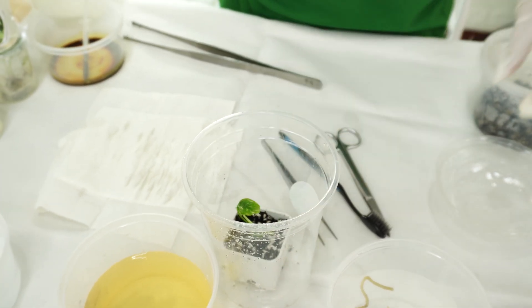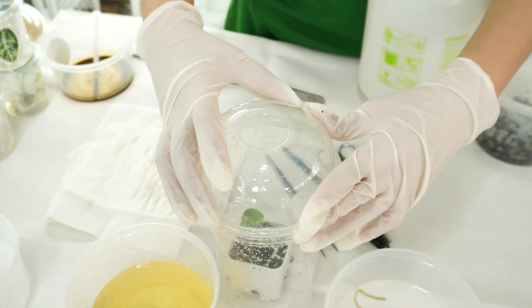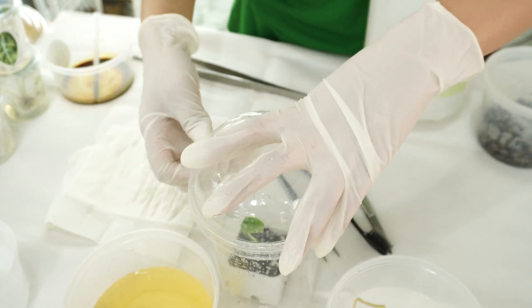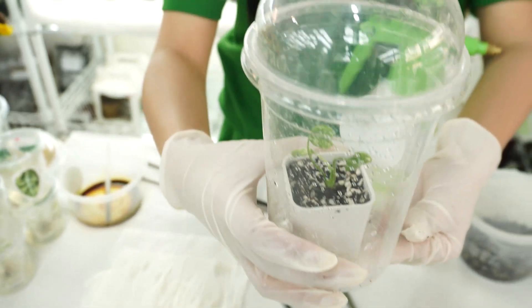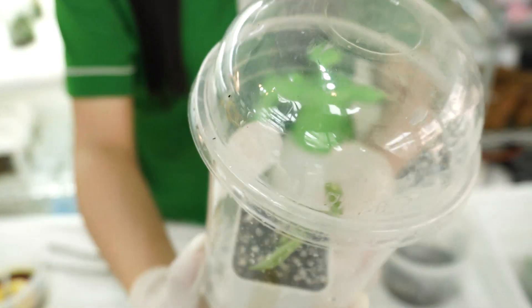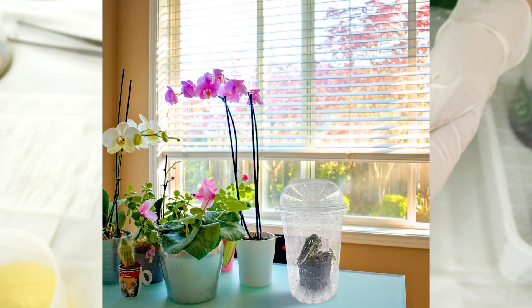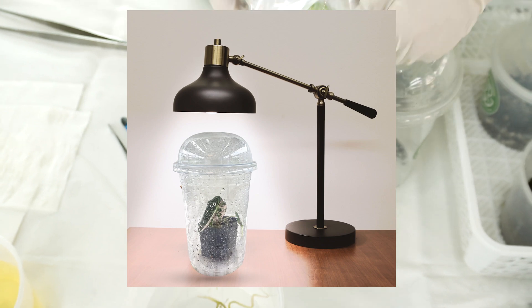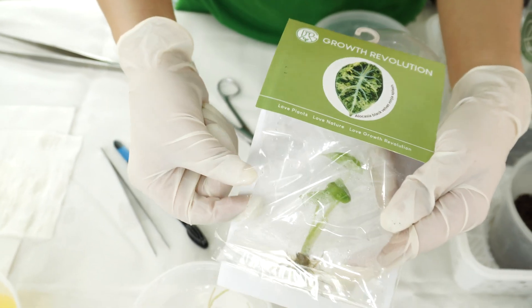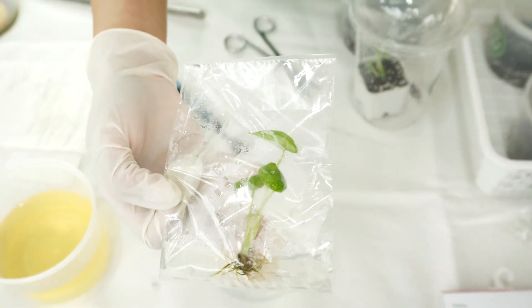Put the little pot inside the dome plastic container and cover the lid. Then just check it from time to time and spray some water if it looks a little bit dry. You can place your plant somewhere with enough light from nature or from a lamp, and make sure it doesn't get too hot.